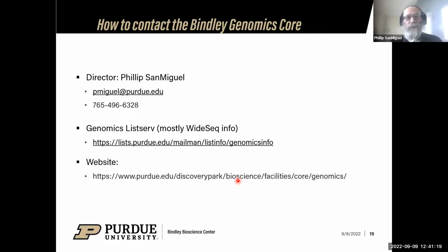So the quality should be basically whatever you give us, you're going to get the sequence of that back. So if you do long PCR and you ran it on a gel and you see a big giant primer dimer on the bottom of it, you're going to get a ton of primer dimer sequence. So it's a good idea to do some sort of cleanup. There are lots of PCR cleanup kits that'll get rid of most of the primer dimers. If you have just a couple of bands there and you're worried, well, there is reason to be worried. Say instead of one nice crisp band, you see two bands. If those two bands are unrelated to each other, then you'll just get the sequence of both of them.